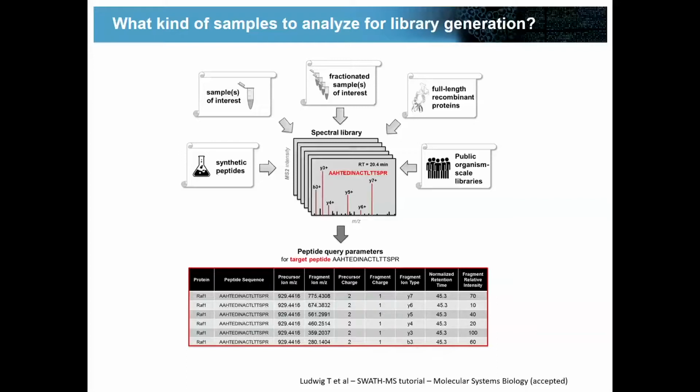The issue is that our experience has been, in this direct comparison of single-shot analysis of DDA versus DIA, you tend to have better sensitivity and coverage in the DIA data. So a simple single-shot replicate analysis of the given sample of interest is probably not going to generate a sufficiently large spectral library to completely exploit all the information that's in the DIA file.